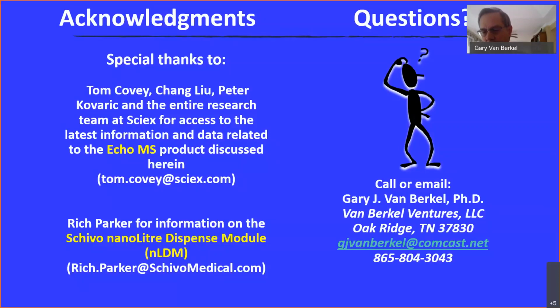And I guess the last question is, do you foresee any future applications or developments for droplet dispensers? You kind of went a little bit into that earlier, but anything on the horizon that you can forecast? Again, I would point people to my full talk that's available, I think, on request from Shivo. But there are people doing a lot of gas phase chemistries right now with single droplets, so putting the droplets into those devices, and then those devices have to dispense to the mass spectrometer some way. So that's going to be one area.